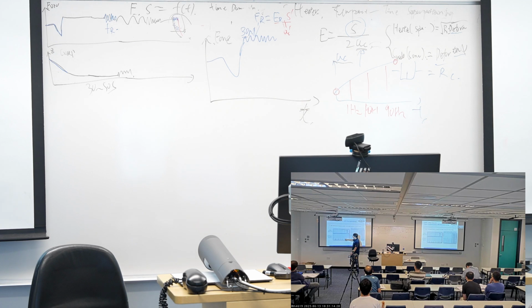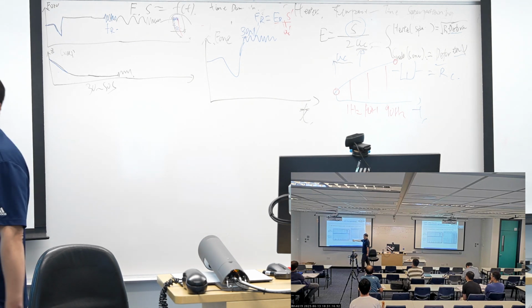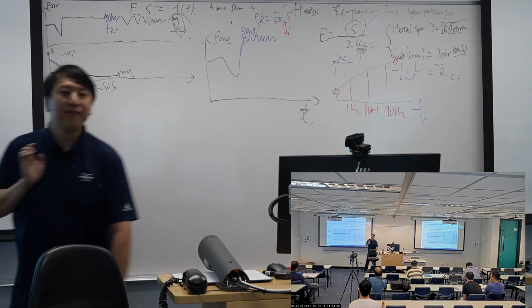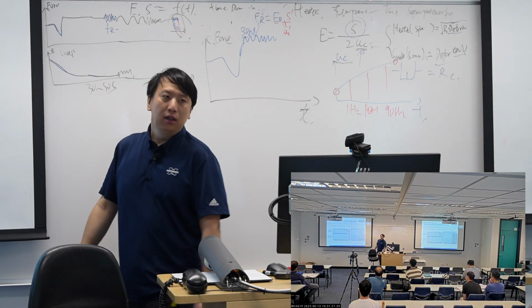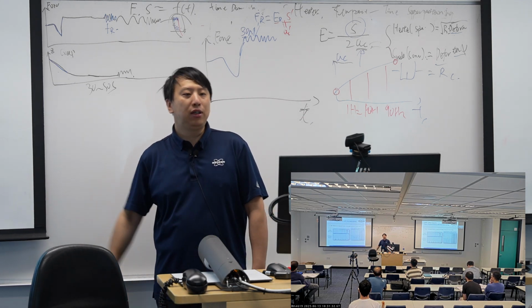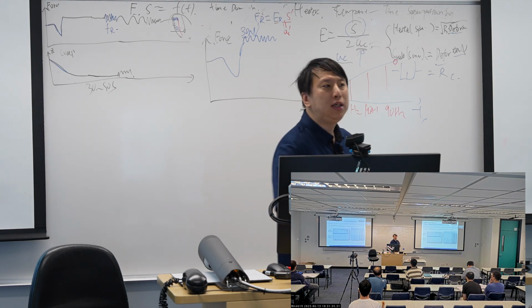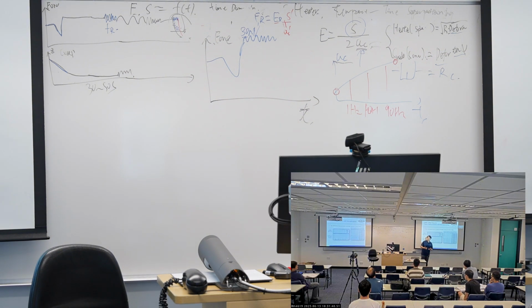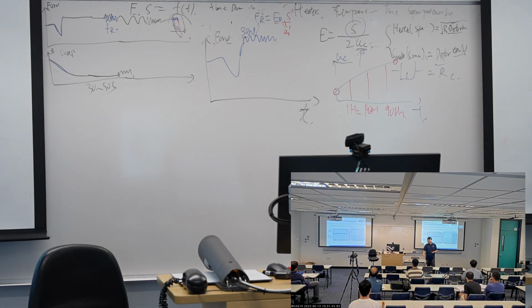And finally, it will generate this kind of spectroscopy. The modulus against the frequencies changing from low to high. Yeah, usually it's something like this. The viscoelasticity we observed yesterday in most examples, as shown by the Maxwell model, is the modulus will decay against the time. Once it stays longer, it will be softer.